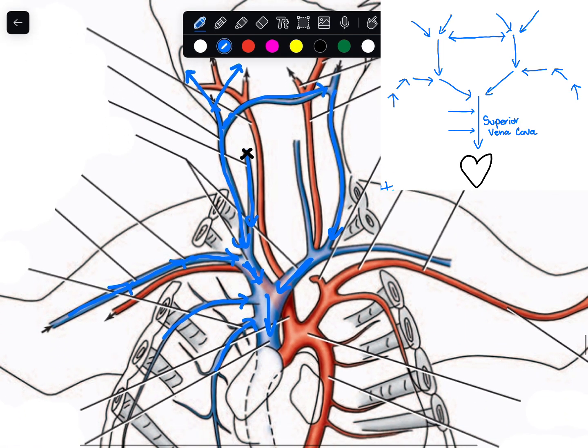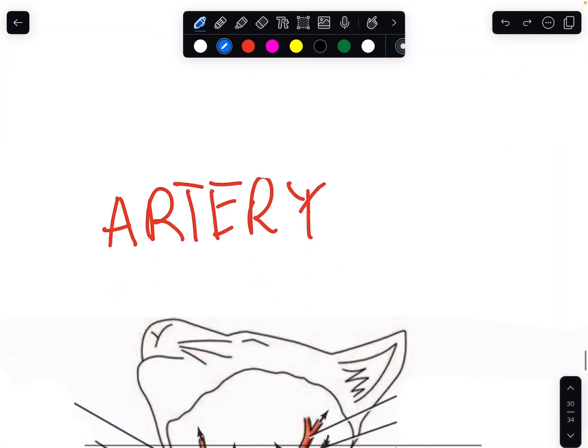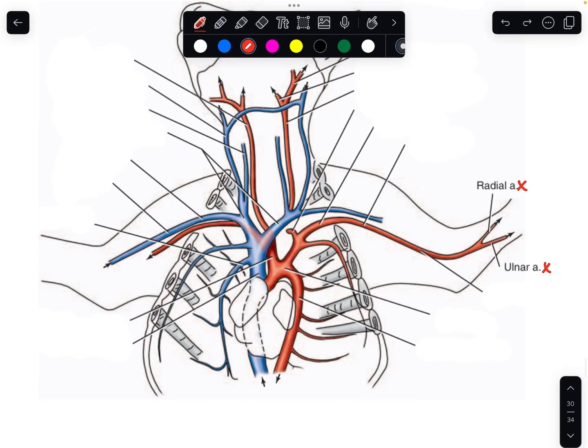Okay, that was just a weird jab session. Let's just keep going.